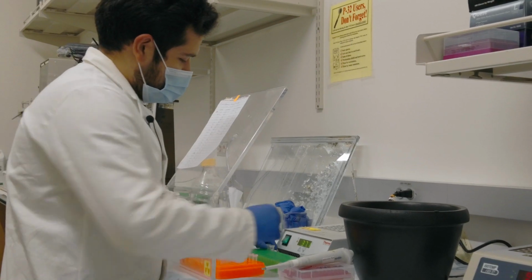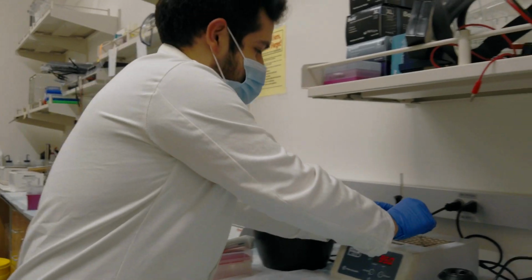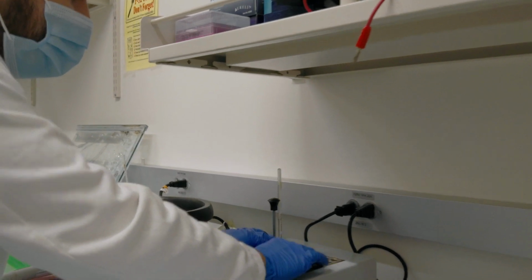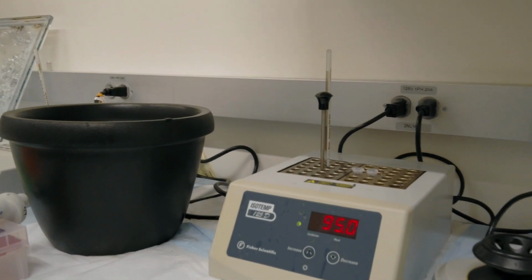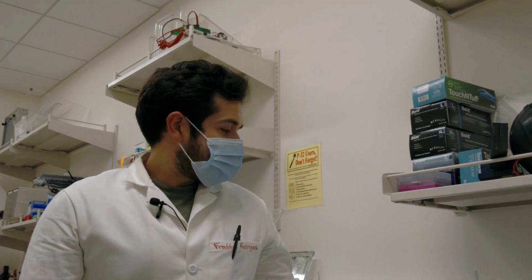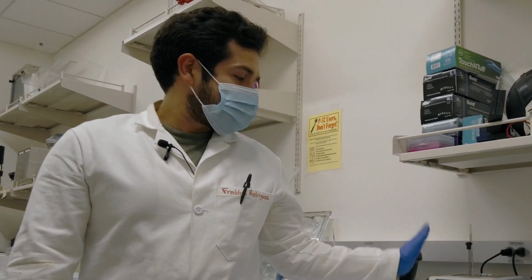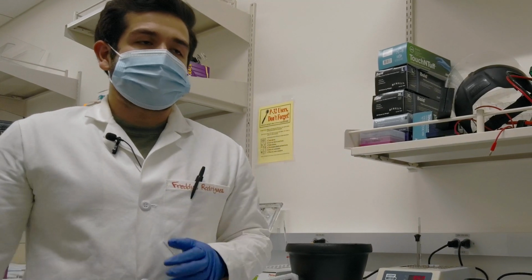So now we're going to move both of these samples that have both template and primer strand DNA onto this preheated heat block at 95 degrees C. So what we're gonna do is we're gonna heat them up. We're gonna let them sit there for 5 minutes. Afterwards, we're going to switch off the heat block and let them cool down to room temperature.